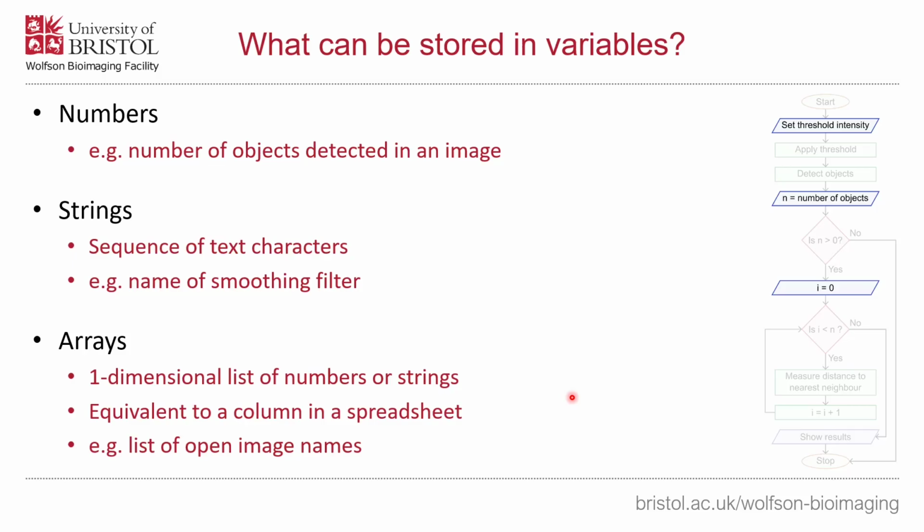So later on, when we're looking at dialog options with DOM, there's one where you can create this drop-down menu, and that menu needs to know what options it can have. You tell that particular dialog box what its options are. You pass those in as an array of text values. So you say, well, you could be Gaussian blur, median, mean, max, and so on.